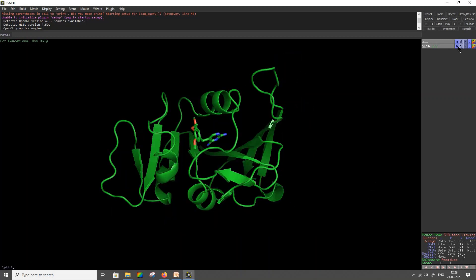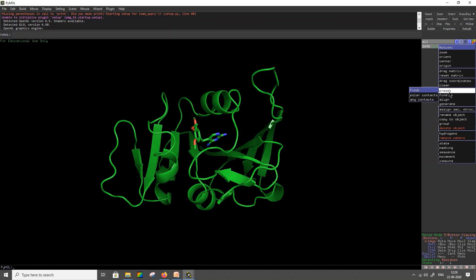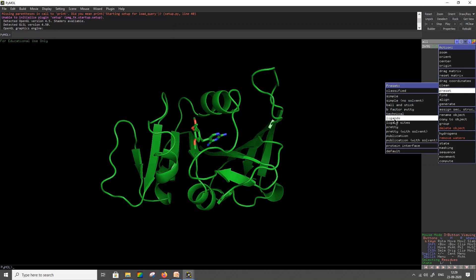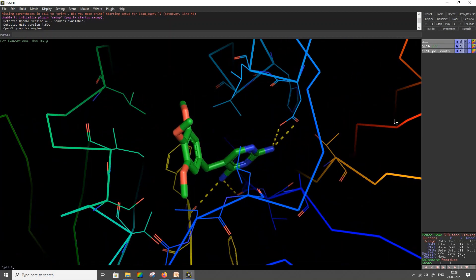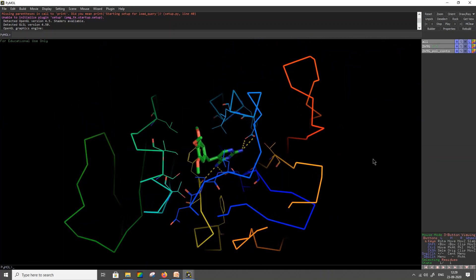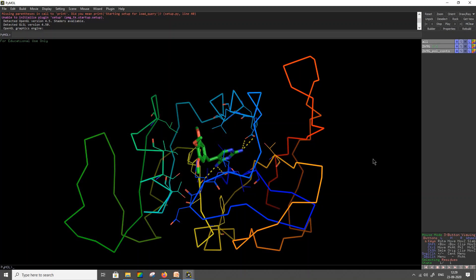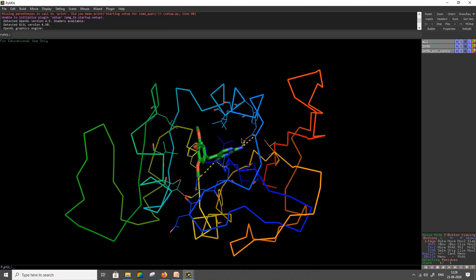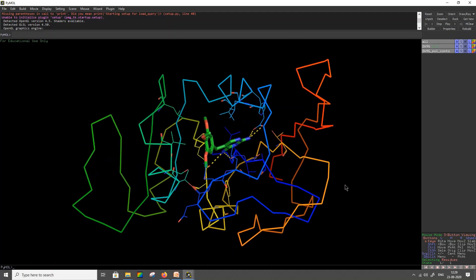First, click on Action, go into Preset, and click Ligands. This action will straight away differentiate and separate out all the residues of the protein that are in close proximity or that are interacting with the ligand molecule. However, the non-interacting amino acids or residues will be represented in a ribbon structure.